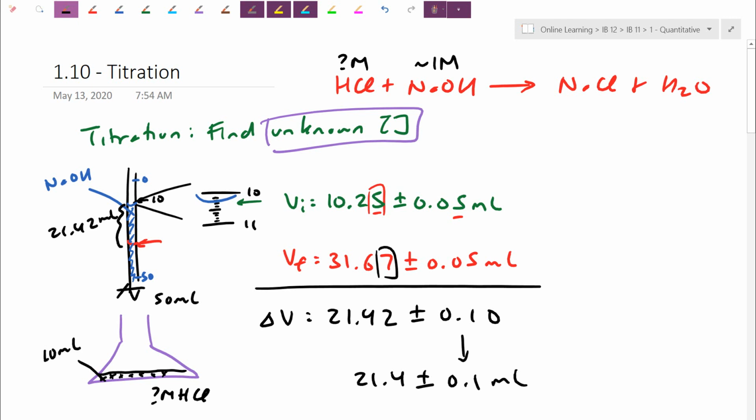How the titration here is set up, I'm just going to introduce you the basics and then show it to you on the virtual simulation. Basically, there is an unknown concentration I'm after. I have a bottle of HCl labeled. I don't really know what the molarity of HCl is currently, or even if I do know the molarity, I want to do it in such a way that I know it to more detail. This HCl is going to come with it a bunch of H plus in my 10 milliliter sample. What we're going to do is we're going to slowly drop in the base. I want to drop in the base in such a way that the base is going to help count the number of acid molecules that I have.